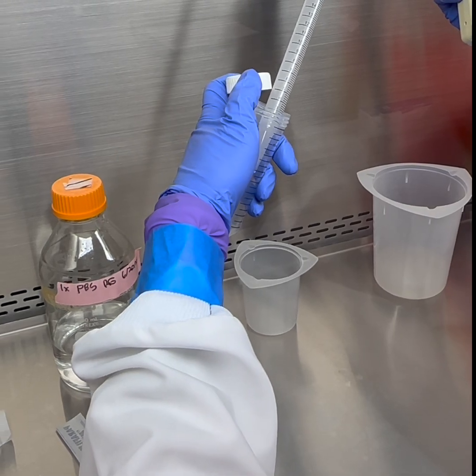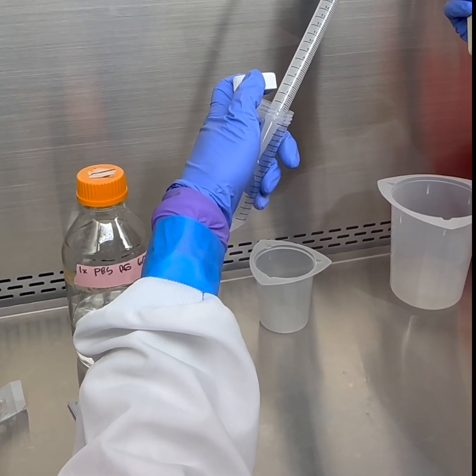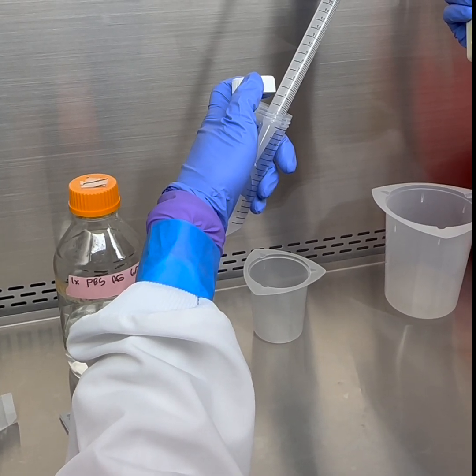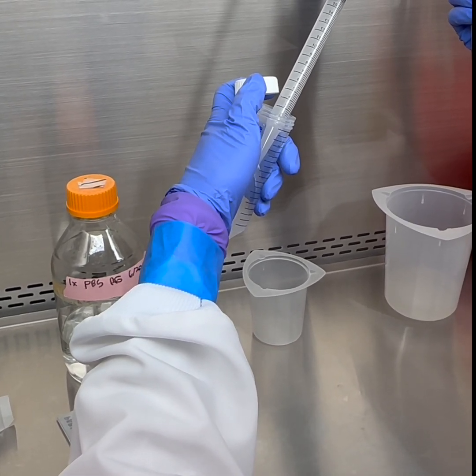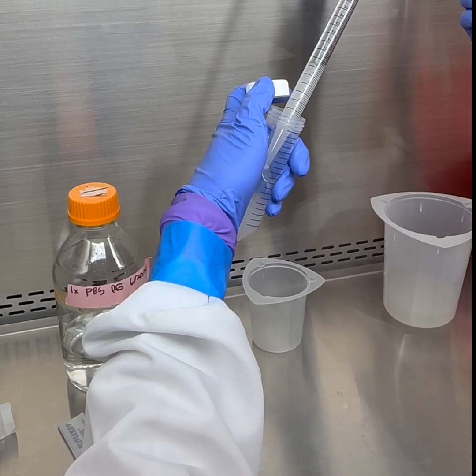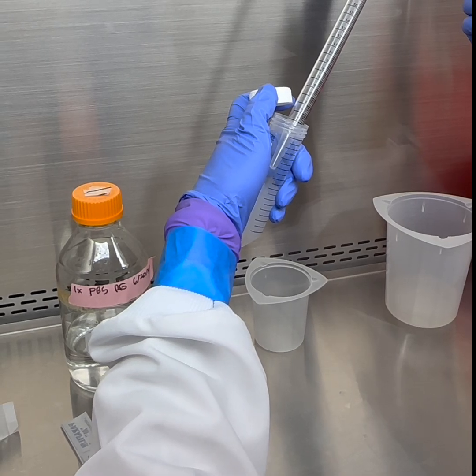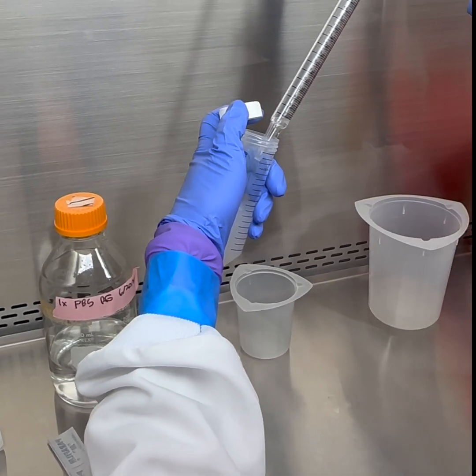All right, and now what I'm going to do is put the tip of the pipette to the side and slowly dispense and see if I see any specks. If I see any specks, I'll mix it a couple more times, because specks indicate that you have biofilm that was not broken up. But yeah, we look good.